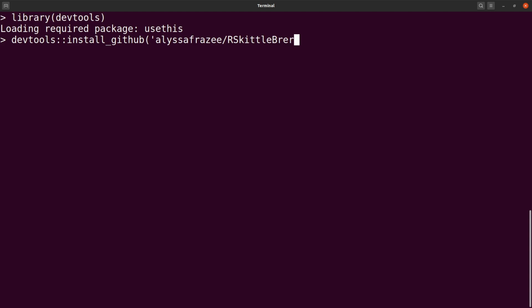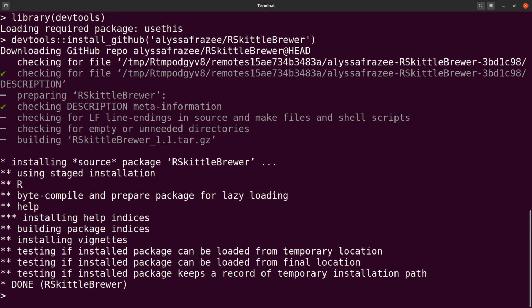Yes, so this package here, this is what we are getting. So let's close the brackets. Let's check that everything is okay here. Okay, so we have the spellings correct. So we can run this to install this particular package. So let's do that. Okay, so that package has been installed.